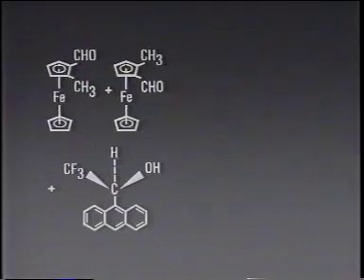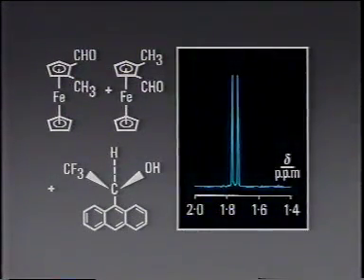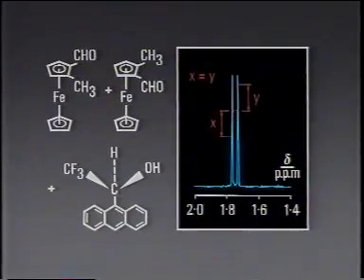But if we add one enantiomeric form of a chiral reagent known to shift NMR signals, a so-called shift reagent, it complexes with the sample molecules, forming two diastereomeric complexes. Being diastereomers, these have different physical properties, unlike the original enantiomers, and hence different NMR spectra. This partial spectrum shows the methyl group singlet split into two in the presence of the chiral shift reagent. The integral tells us that each enantiomer has equal intensity. That is, this sample is a 50-50 racemic mixture of the two enantiomers.